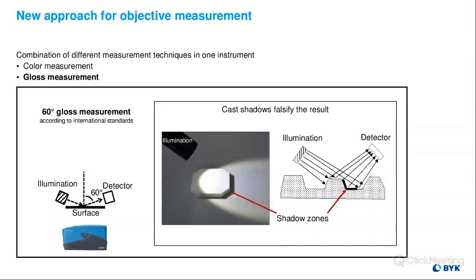But of course, it is often beneficial to measure gloss on our surfaces. And this is really where the difficulty in measuring grainy or textured surfaces comes in, because a typical gloss meter measures with the illumination coming in at an angle off of the normal, typically 60 degrees.